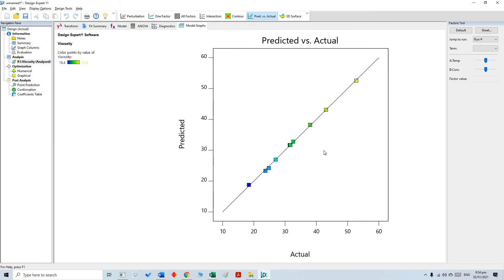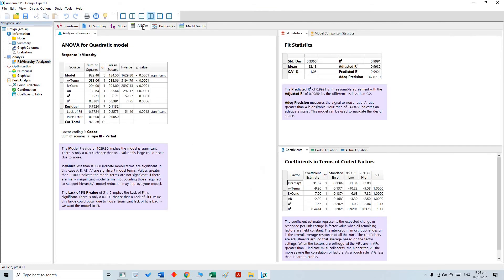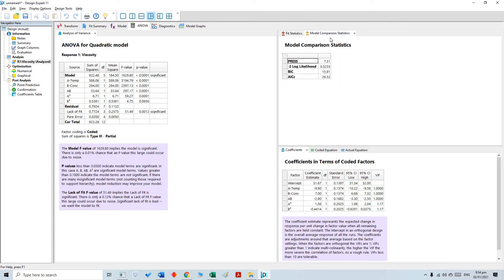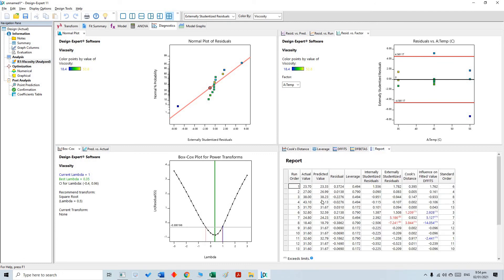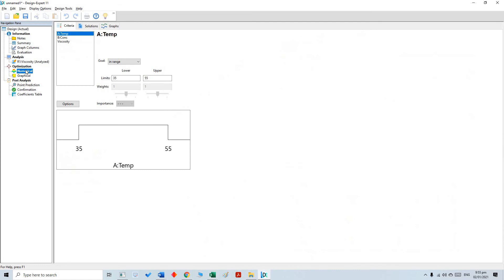This is a very accurate model developed by RSM. We can see the model comparison and our predicted versus actual values both here in the report. That concludes the model development phase. The next step is optimization.